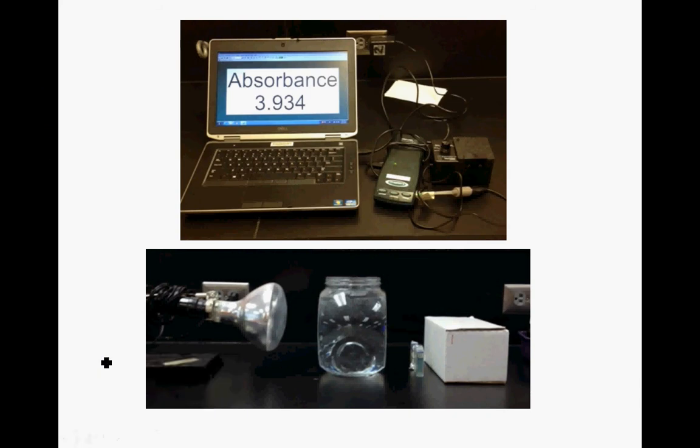What we see here is that you're going to need a computer, you're going to need a LabPro setup, and this is a colorimeter - something that measures color. A colorimeter is not a fancy spectrophotometer.